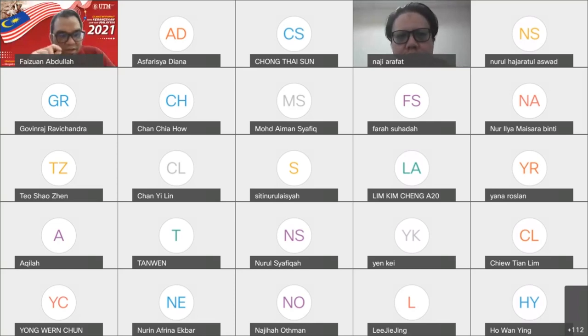Okay, nickel can be easily measured using DMGH. It is very famous for nickel. But if you ask about all metals, not all metals are suitable for this gravimetric analysis. There are certain precipitants that are very useful to measure some types of metals.